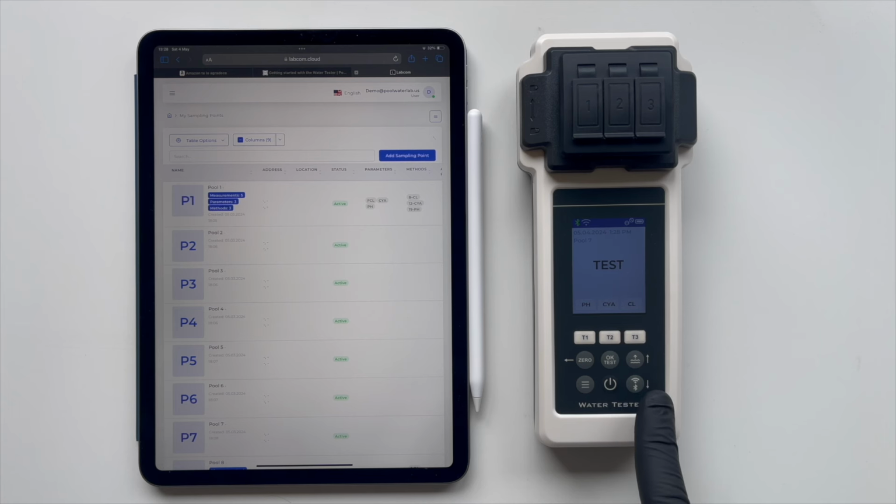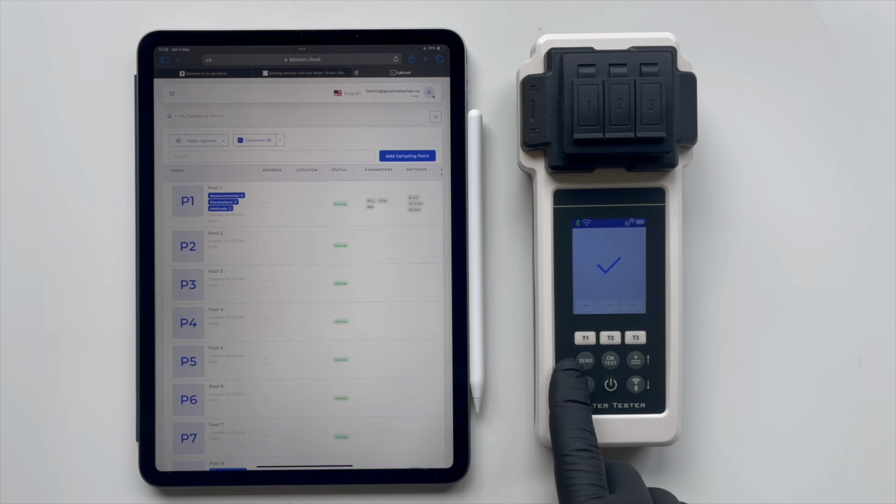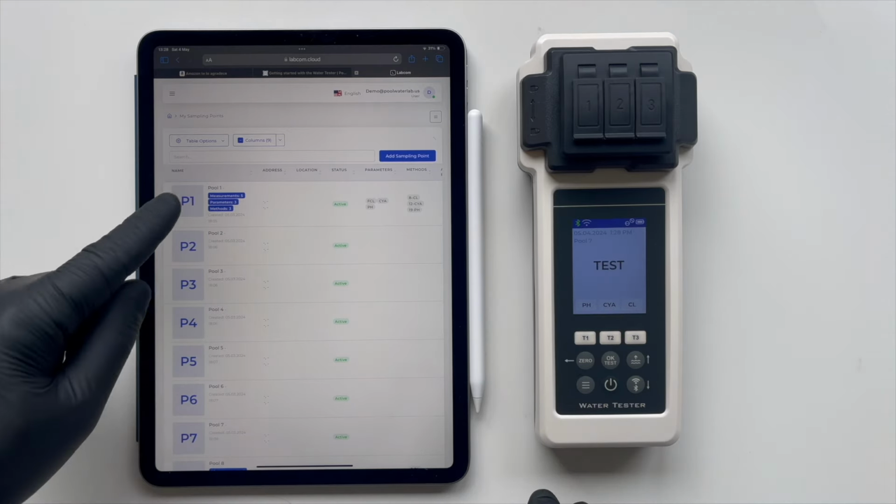To have the tester send the measurement results to the cloud storage and synchronize, we need to press the Bluetooth Wi-Fi button once. However, this is only necessary if your tester is connected to a Wi-Fi network. We press the button and wait for the synchronization to complete, which may take a few seconds. The tester has successfully synchronized the data with the cloud. This means that all the test results previously stored on the device have now been uploaded and securely saved in the cloud storage system. Press the 0 button to go back.